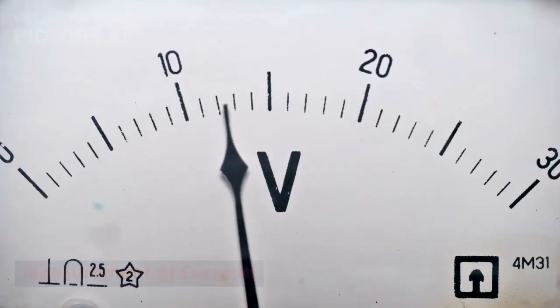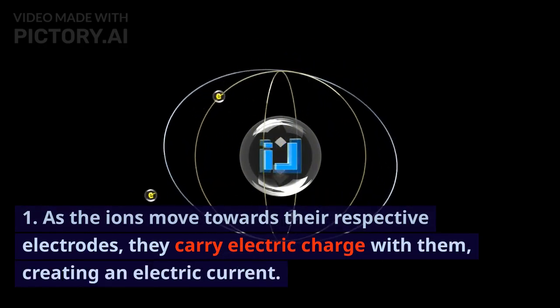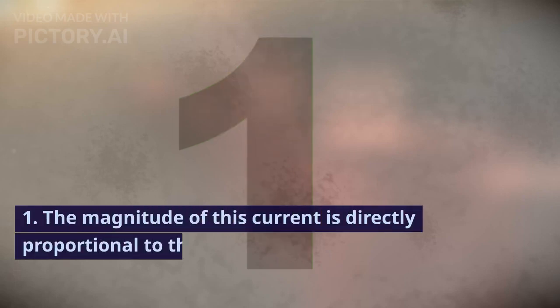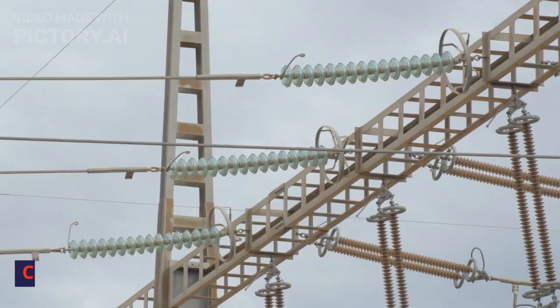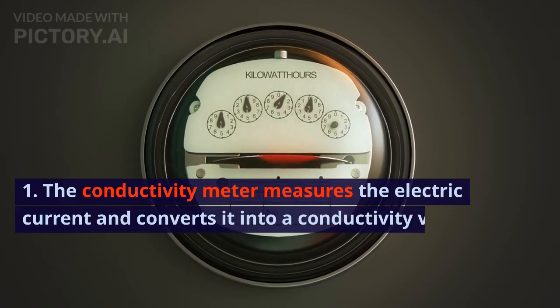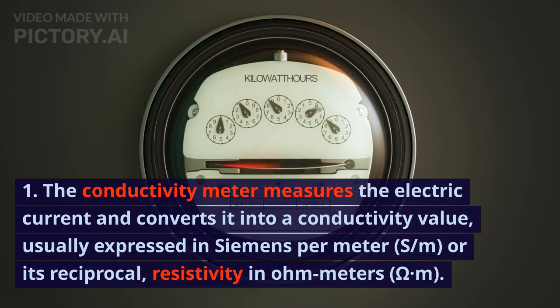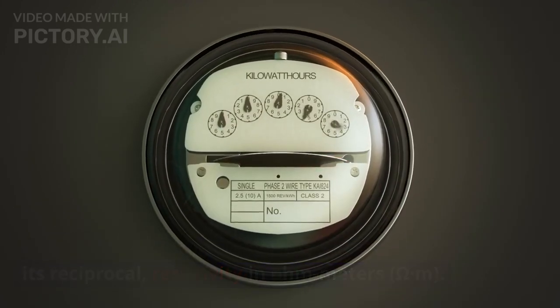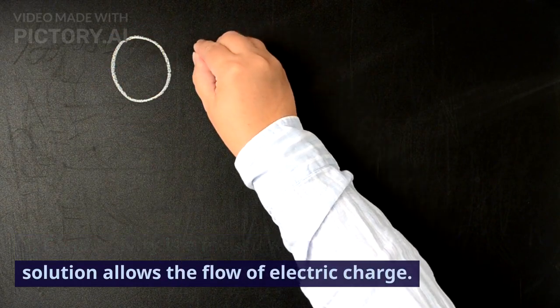6. Measurement of current. As the ions move towards their respective electrodes, they carry electric charge with them, creating an electric current. The magnitude of this current is directly proportional to the number of ions present and their mobility in the solution. 7. Conversion to conductivity. The conductivity meter measures the electric current and converts it into a conductivity value, usually expressed in Siemens per meter, S/m, or its reciprocal, resistivity in ohm meters, or Ω·m. Conductivity is a measure of how readily the solution allows the flow of electric charge.